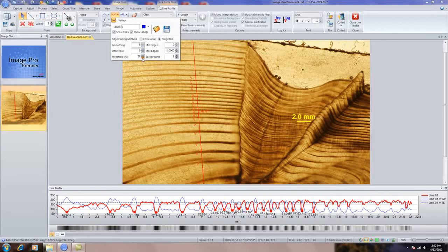So I'm going to do a simple segmentation threshold. By doing that, you can see I can pick up some more of the valleys there. I can also correct for some background conditions. I took that too much, so let me bring that back a little bit. I can easily select the other method. Let me make some adjustments here. If I have too much of a threshold, I bring that up a little bit. Usually what you'll find is one method or the other is better. Let me smooth that out a little bit more. You can see that you get very quick feedback and adjustments.